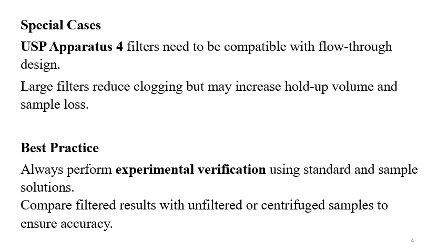Now see the best practices. Always perform experimental verification using standard and sample solutions. It is not that you perform only on the samples or only on the standards. Use both and then understand what is happening. Compare filtered results with unfiltered and centrifuged samples to ensure accuracy.